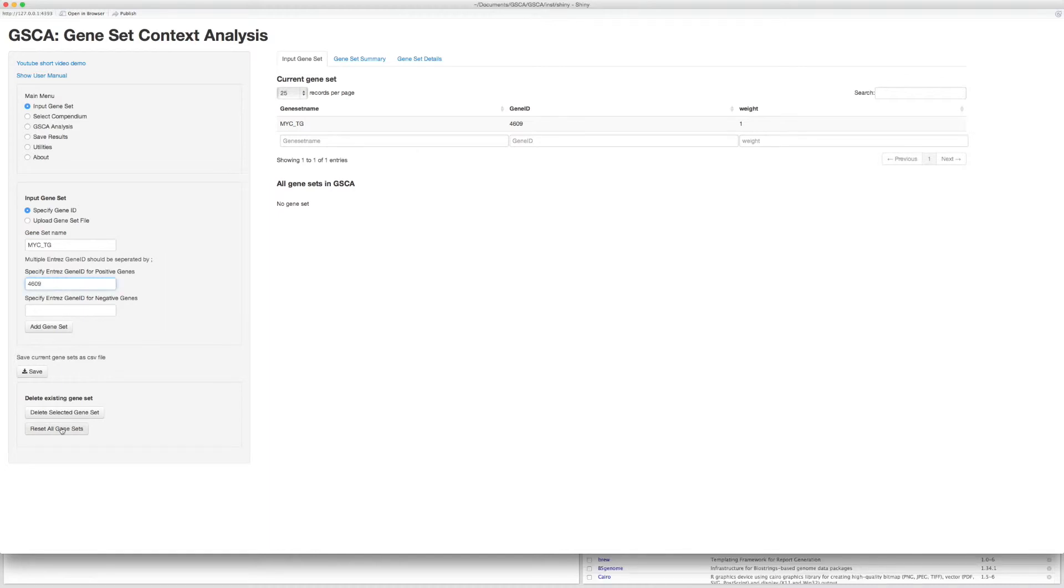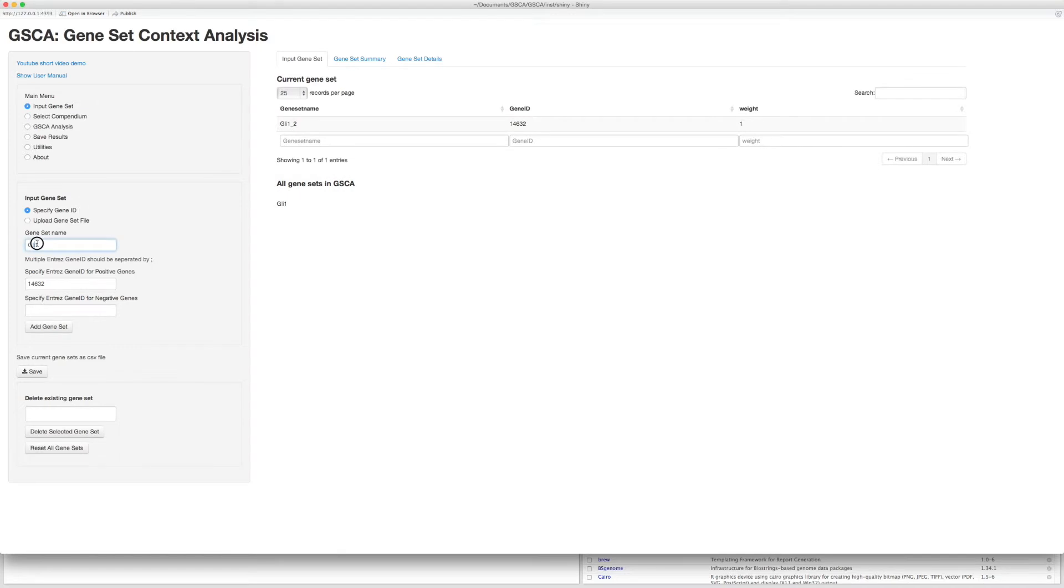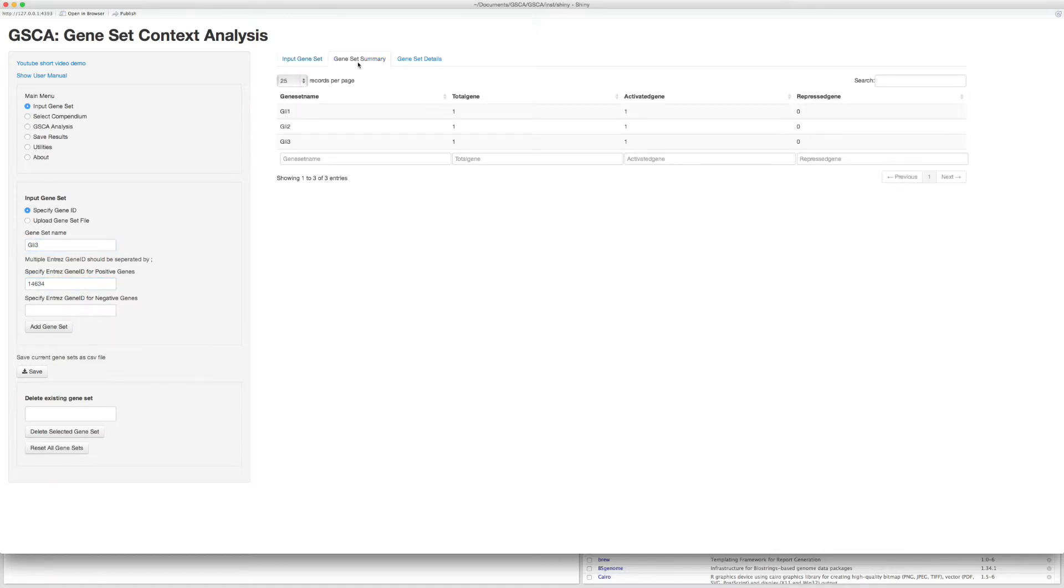The example is about mouse BHLHB1, BHLHB2, and BHLHB3 genes. Input gene set names and Entrez ID one by one. Make sure that your input is correct.